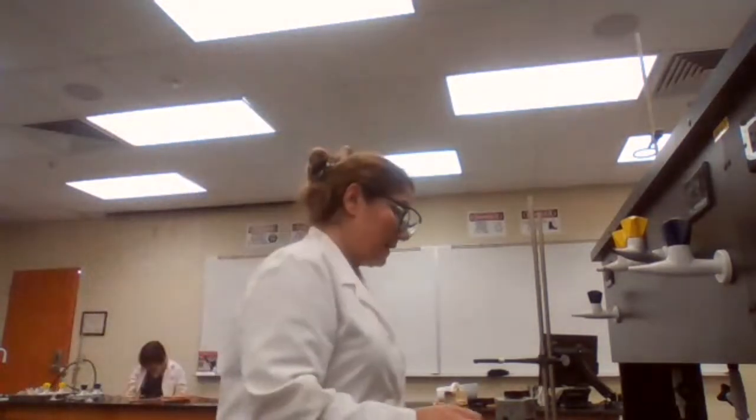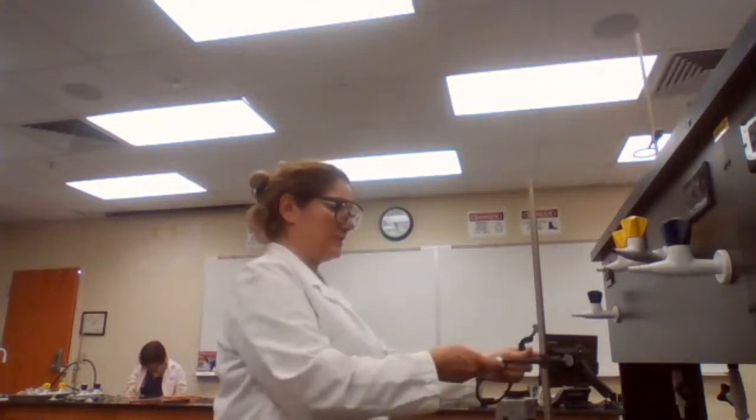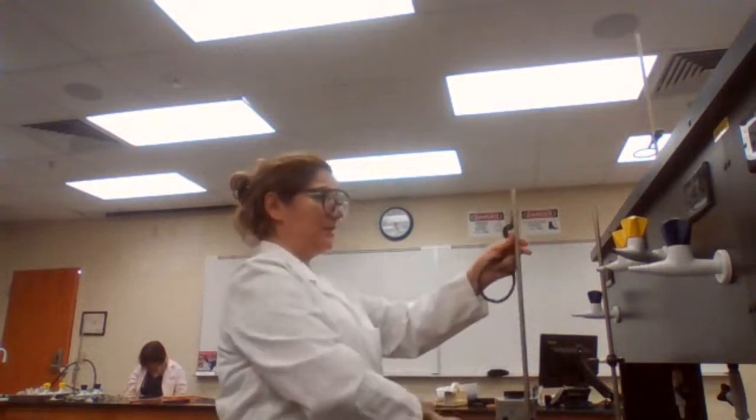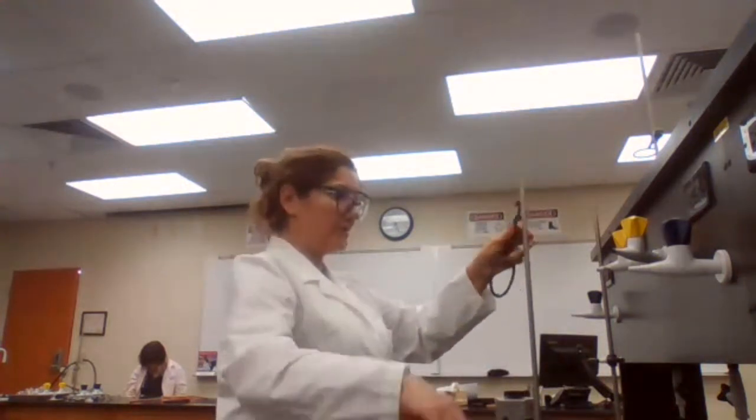Okay, two types of distillation. One is simple distillation, the other one is fractional distillation. The purpose of the experiment today is comparing simple distillation with fractional distillation. You are going to assemble the distillation first.